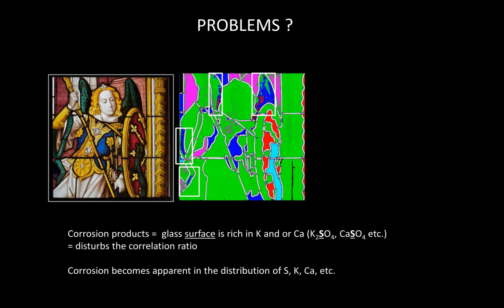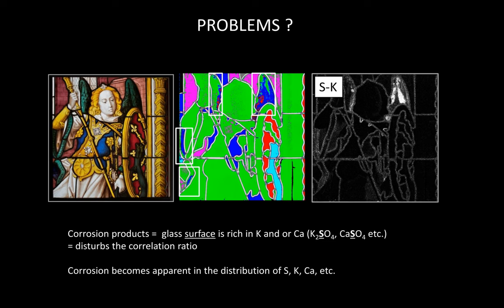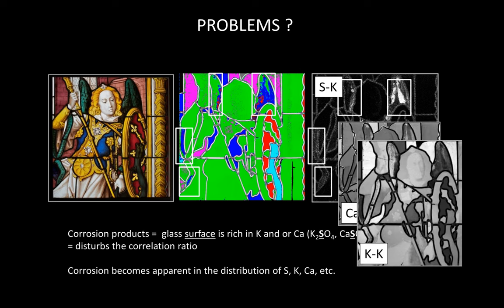Are there any problems with this technique? Yes, there are. You might have noticed that a number of glass pieces contain several colors in the image — these are pieces affected by glass corrosion. As the surface of the glass is enriched with potassium and calcium in the crusts, the correlation will be disrupted. The presence of corrosion also shows up in the distribution images, particularly in the sulfur, calcium, and potassium images. This means the technique will not work well for other glass panels heavily affected by glass corrosion.